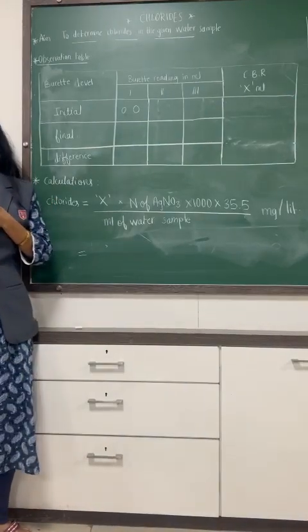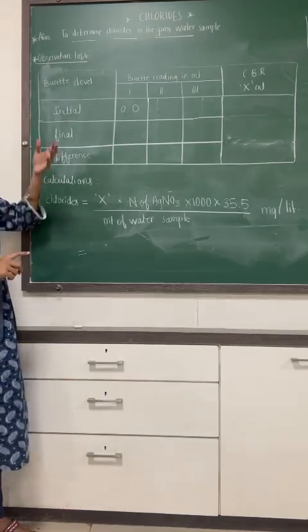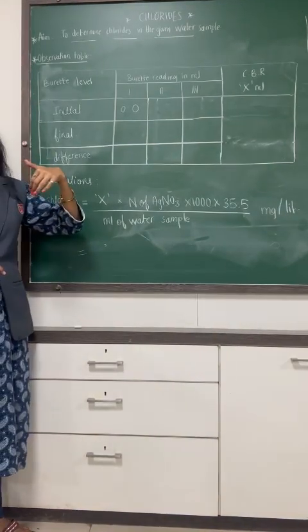You have taken 25 ml water sample in the conical flask and indicator potassium chromate. Now you have filled the burette with the AgNO3.